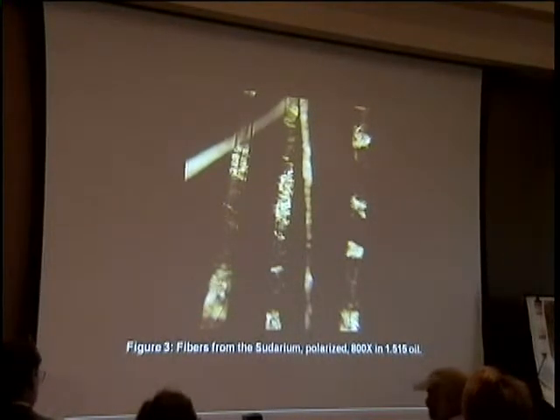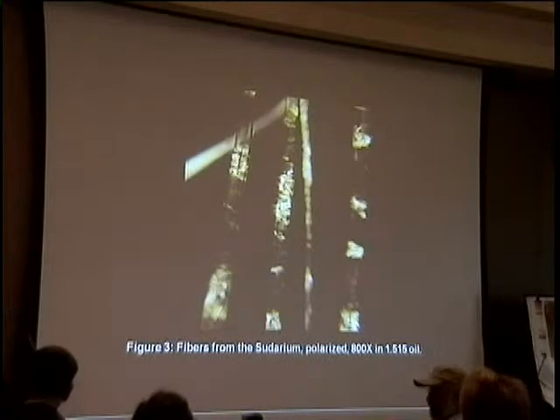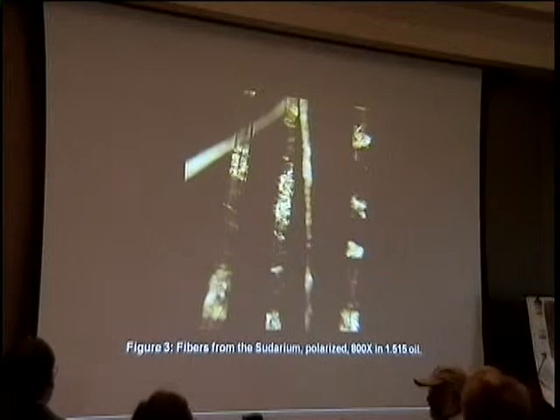Some of the birefringence appears in bright streaks of different lengths and brightness that penetrate the fibers at different angles and for different distances. The general haze in the background was caused by energetic electromagnetic radiation. Any wavelength of light that is more energetic than green can cause such defects. Very energetic gamma rays, X-rays, and ultraviolet light can cause the same kinds of dispersed foggy defects. The defects we see in the Sudarium indicate significant age.